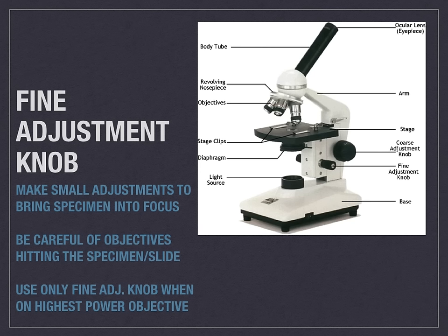When you're using this, make sure you are frequently checking the stage, or you have somebody else monitoring the distance between the objectives and the slide, so that you do not run the objectives into the slide causing damage to both items.